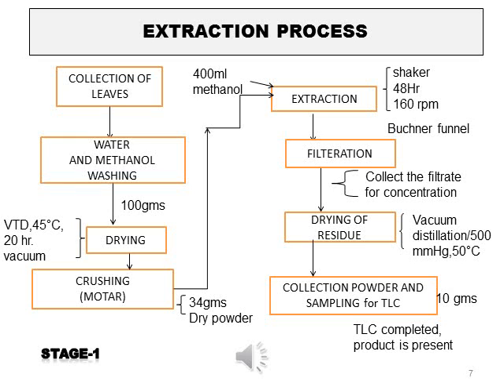Here we had some difficulty drying the residue. We didn't have the evaporation technique, which uses the rotary evaporator. Since we didn't have it, we used the distillation setup directly, maintaining vacuum during the distillation. Up to 500 mmHg we maintained 50 degrees Celsius, not going over 50 degrees Celsius.